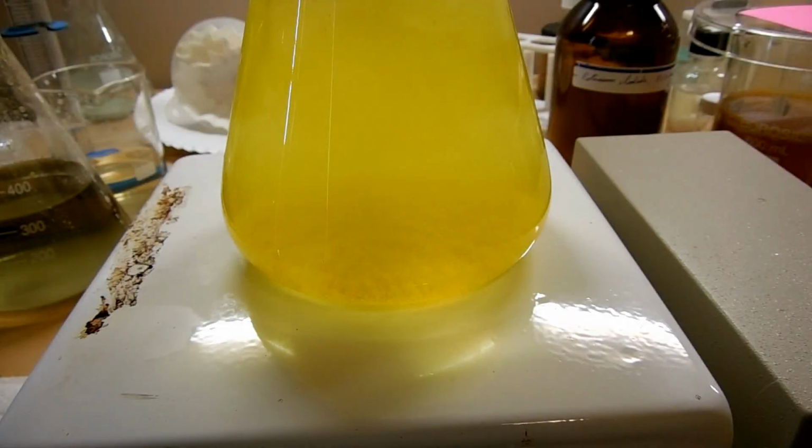Now the really interesting part of this demo is that lead iodide is only sparingly soluble at room temperature, but it's almost 10 times more soluble in hot solution, in near boiling solution. So I put the solution on the hot plate and I'm heating it up. We're going to try to dissolve the rest of this precipitate, and I'll give it a stir every so often.